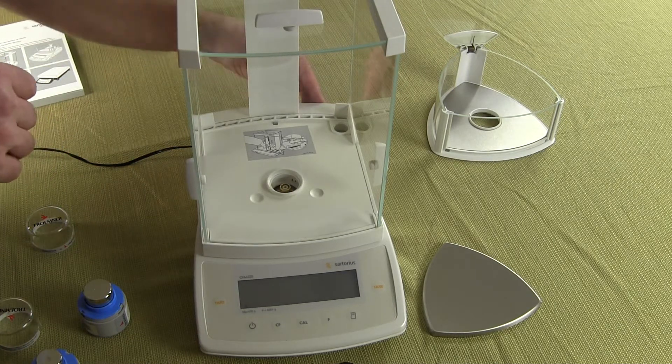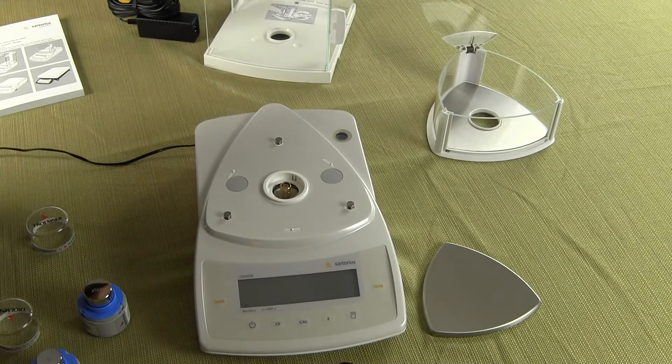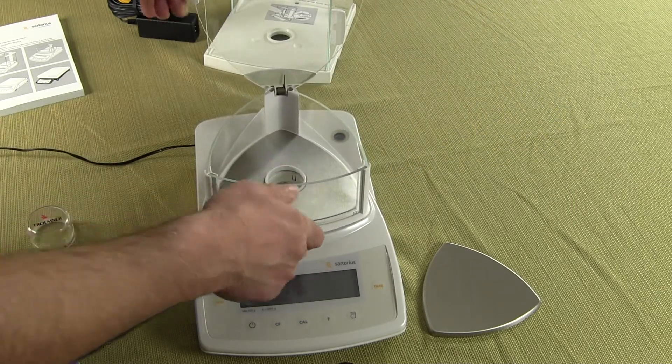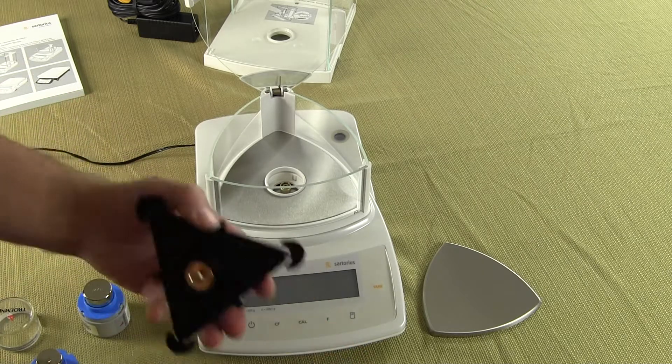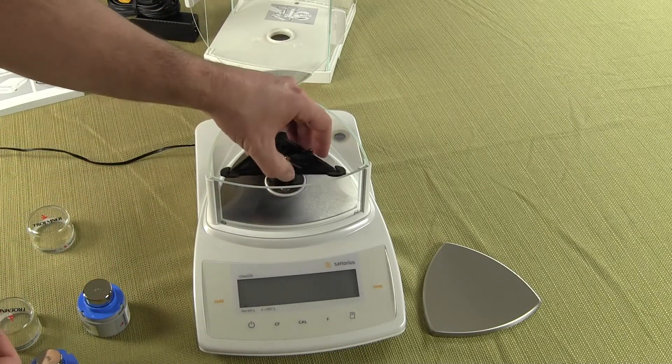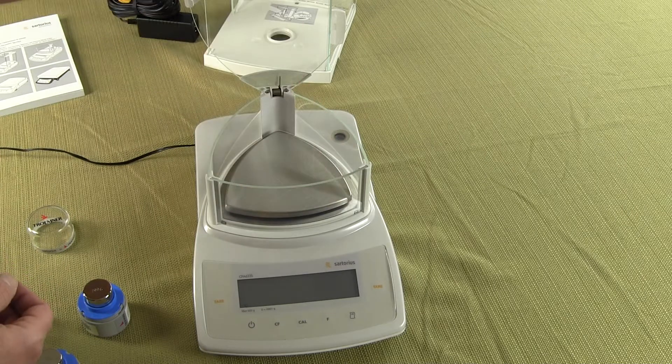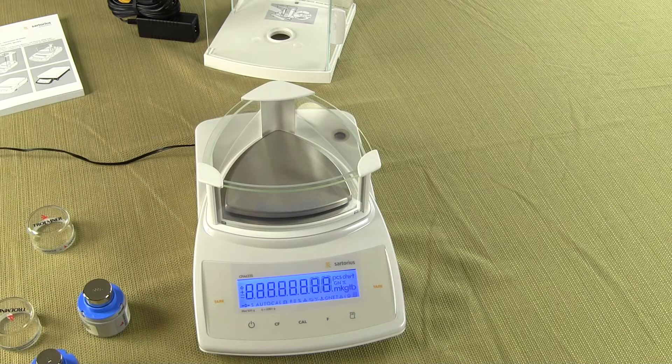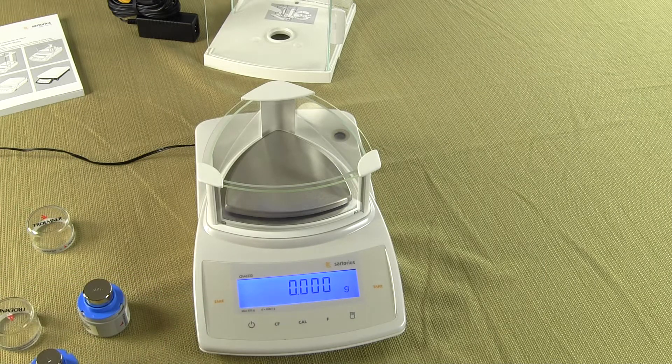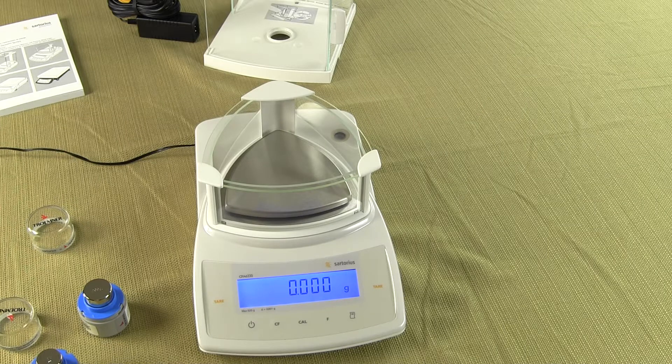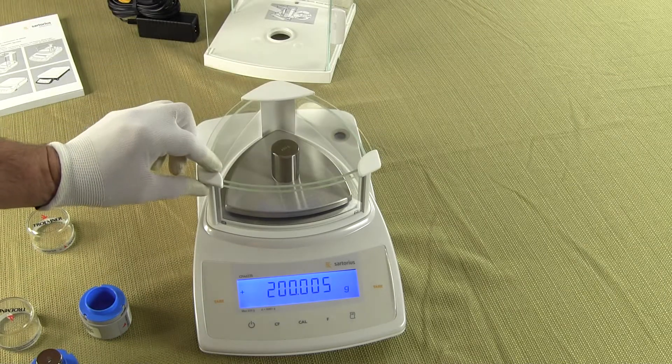So I want to remove this for a minute and I just want to throw this draft shield back on for a second. And then simply once again the pan support, then the weigh pan, we can power up the balance. When you power up the balance again one simply presses the tare key to zero it out. And again for any kind of weighing application you would just open up the draft shield, put the item on, close the door.